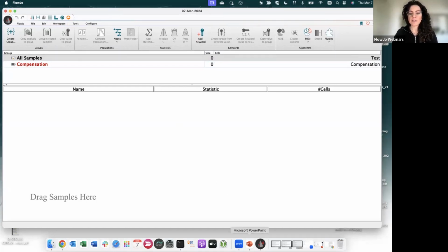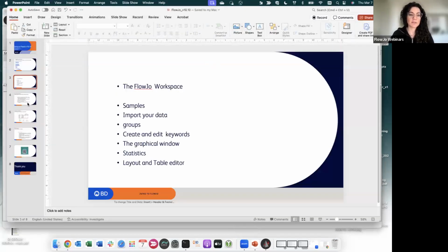So I will start by showing you which are the samples that we will analyze today. Don't be scared if you see that there are many samples or something like that. Just imagine that you are doing exactly the same things with your own experiment. So try to translate whatever you see today to your own project, to your own experiment setup. The point of this webinar is to show you what you can do within FlowJo, and then you can adapt that to your own needs and to your own experiment.